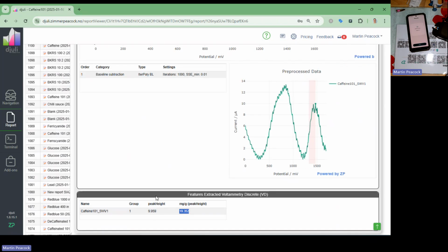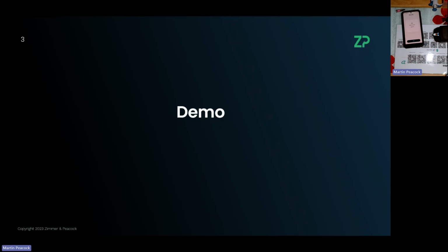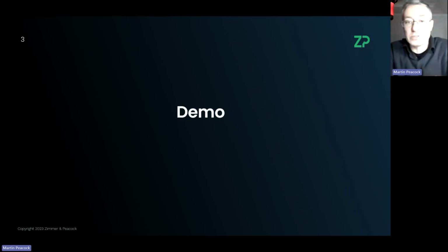So what I'm demonstrating here is something called the Sensit-All Potentiostat from Zimmer and Peacock. It's a normal potentiostat, but it's also what they call in the tech industry an MVP, a minimally viable product, in that it can actually turn lab ideas into tangible products really quickly. So that was the quick demonstration, and everything else now is in the context of that demonstration, let's say.